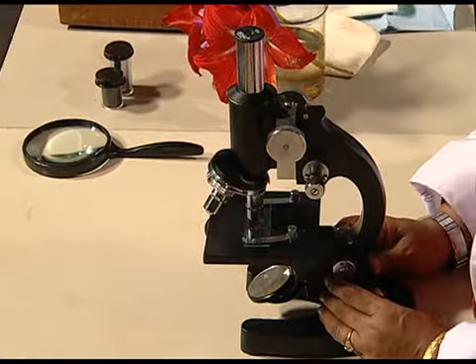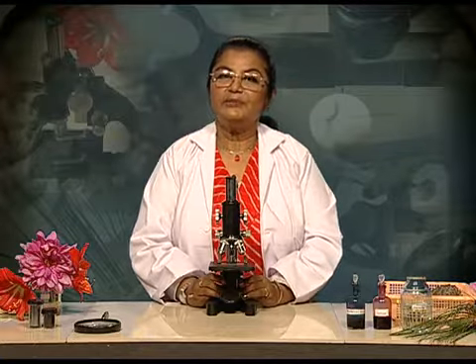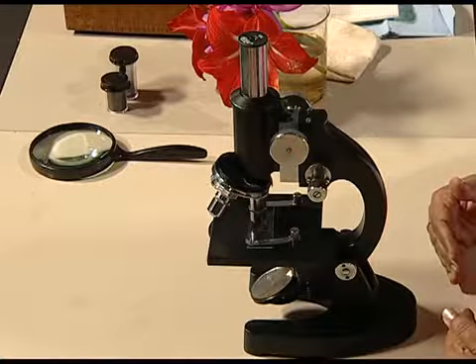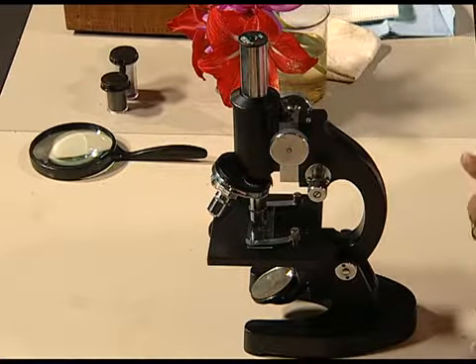A compound microscope is a very expensive instrument that is used in a lab. So we have to take utmost care of a compound microscope while using it or while storing it. First and foremost, you should place the microscope with its arm facing yourself and 15 centimeters away from the edge of the table to prevent its accidental fall.